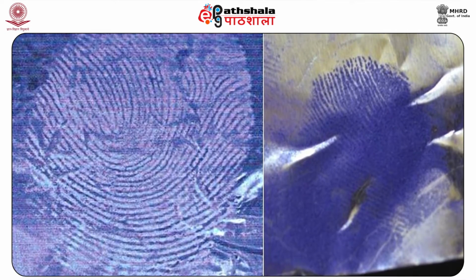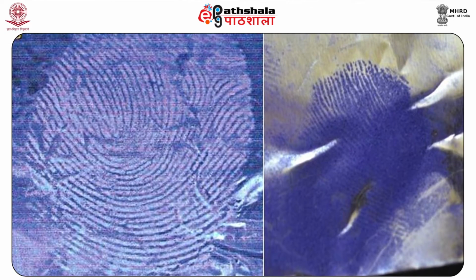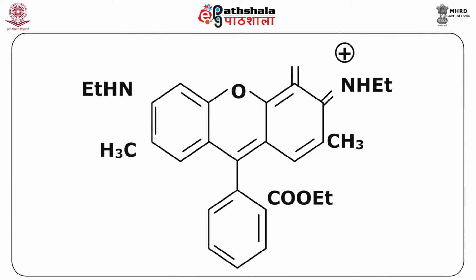The stain gets selectively adsorbed on the polymerized cyanoacrylate. Likewise, the rhodamine treated prints also get preferentially adhered to the polycyanoacrylate deposition and hence are suitable for laser examination. Moreover, the absorption spectrum of the stain matches with the blue-green illumination of the argon laser.